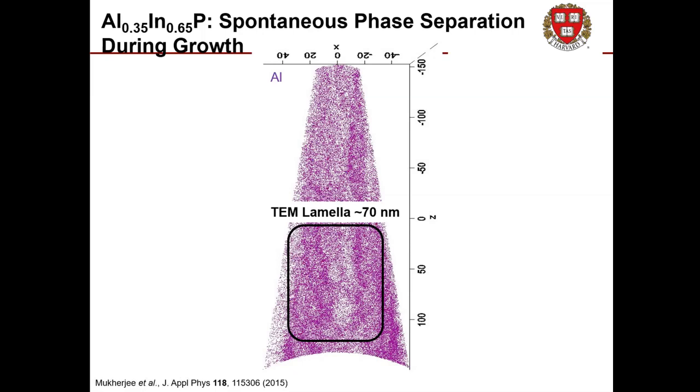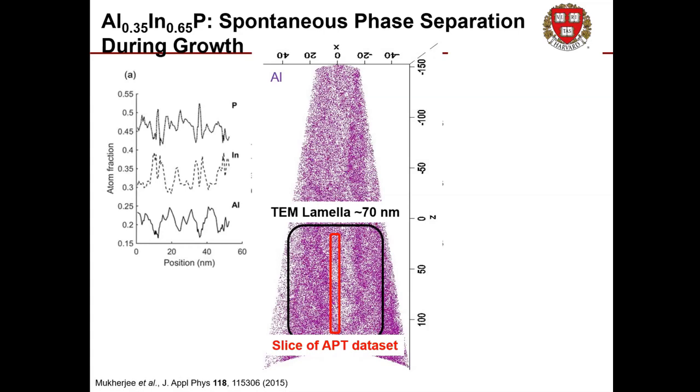However, this is volumetric data now in atom probe. We can slice it however we want. So if we were to, for example, take a 5 nanometer thick slice and bin that in one dimension, we extract fluctuations like this, where we can see the aluminum bouncing up and down over a full 10% range, which is now getting much closer to the quantities that we were seeing from photoluminescence. That, of course, is trying to directly compare it with TEM, but atom probe can do more.